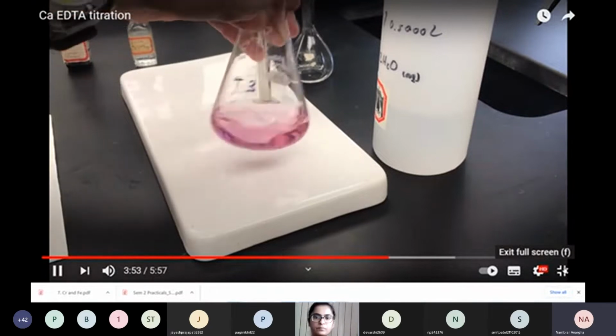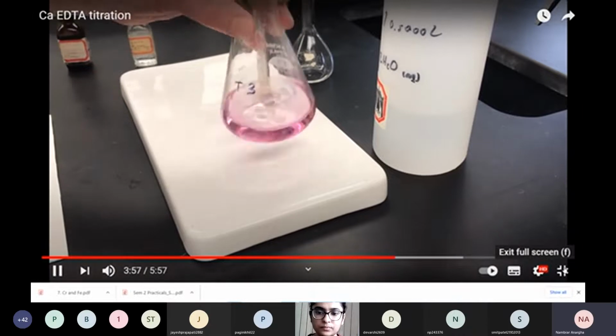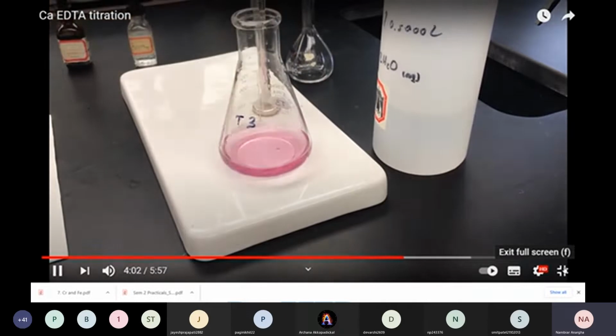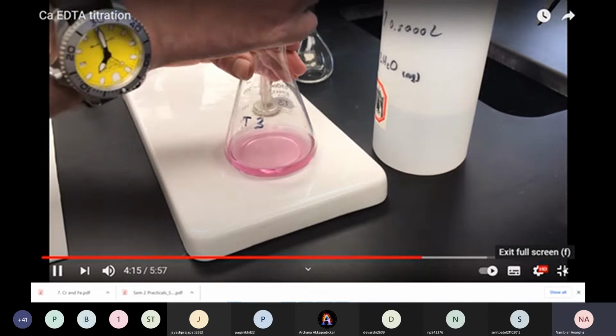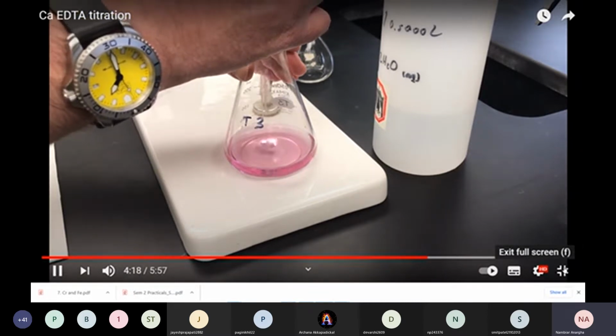So we'll go to about 15.5 here. There we are. All right, so we'll just take a quick assessment of our color at this point. Now you'll notice that the color seems to be maybe just a little bit darker, so I may be approaching the purple, but I still have a little ways to go. So we'll go drop-wise, or a few drops at a time at this point. So I'm going to set my burette up to slowly deliver a drop or two at a time.